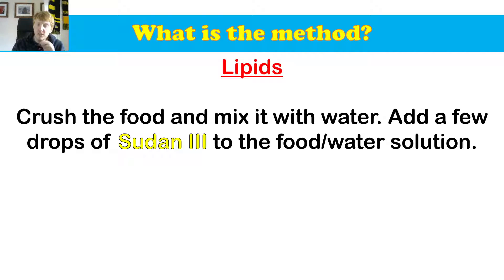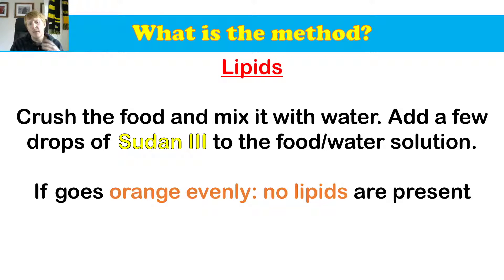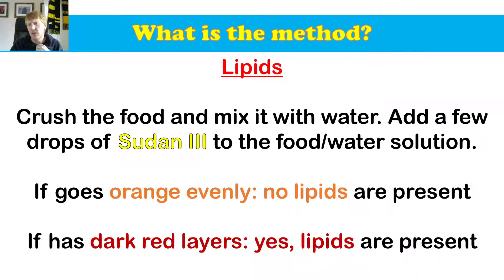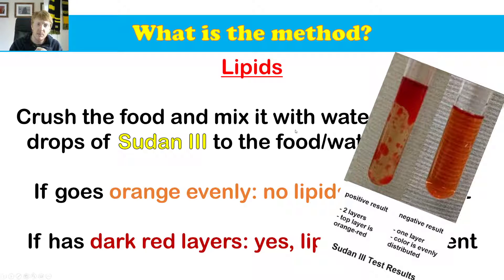Next, lipids. To look for lipids, all you need to do is crush the food and mix it with a little bit of water. Add a few drops of Sudan 3 to the food and water solution. If it goes orange evenly, no lipids are present. But if you've got dark red layers in it, lipids are present. You can see on the right that one has those dark red layers, meaning lipids or oils and fats are present, whereas the other is just uniformly orange, meaning no lipids are present.